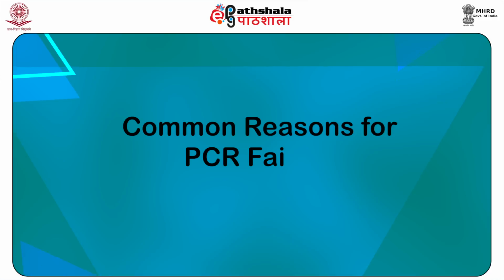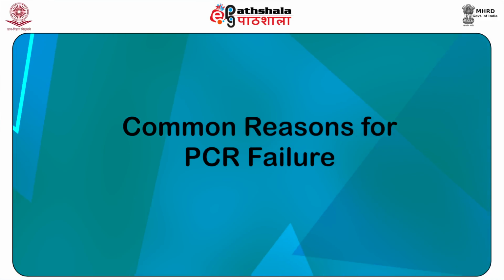Common reasons of PCR failures are as under. It is usually difficult to find the cause of PCR failure. Causes of PCR failure are complex. Failure can be due to multiple factors or due to only one factor. Proper analysis of all the factors is very important for getting accurate amplification.